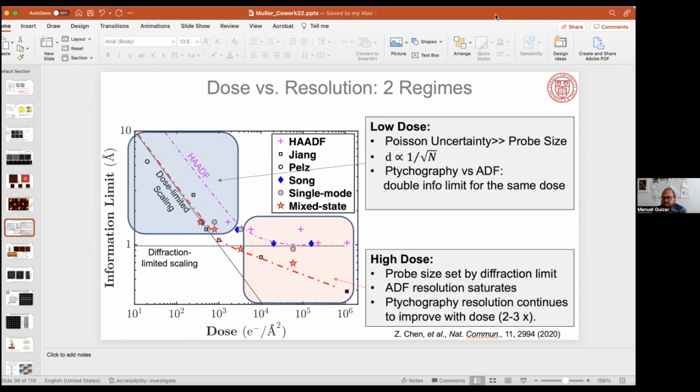If there is no other question, I have a very quick question, because the results that you showed, David, on the multi-slice, I think you said something that is maybe too generous about X-rays, that the multi-slice is well used in the X-ray community, and I don't think this is quite the case. We have done a few demonstrations, but Chris Jacobson has shown a huge potential that can be gained when you do tychotomo, if you can take advantage of this multi-slice. So I wanted to ask you, from your experience, how much do you think one can push with electron data? How many slices can you get out of it?